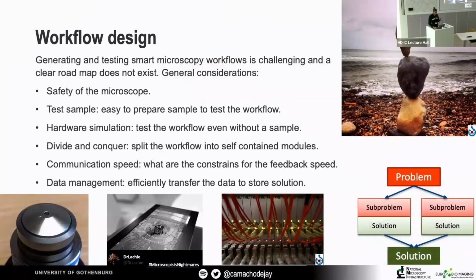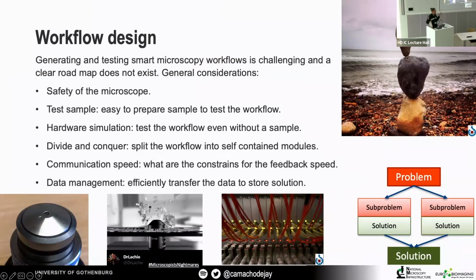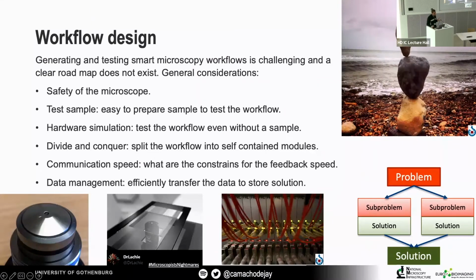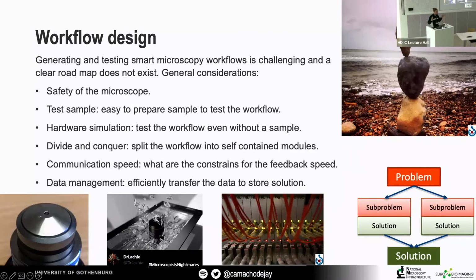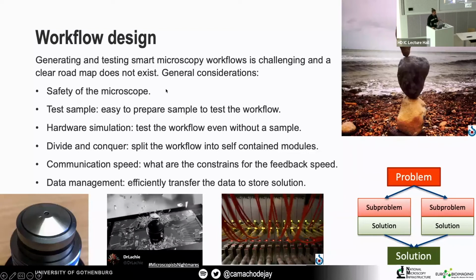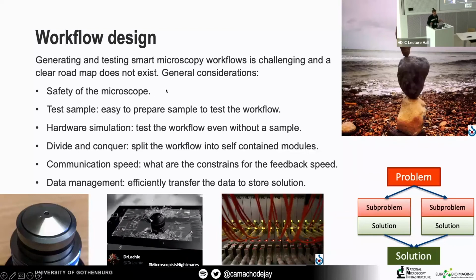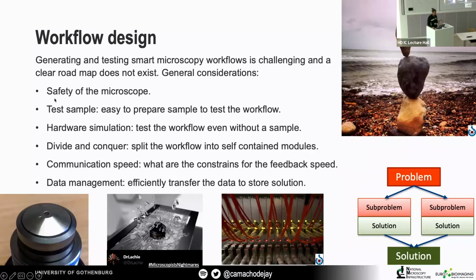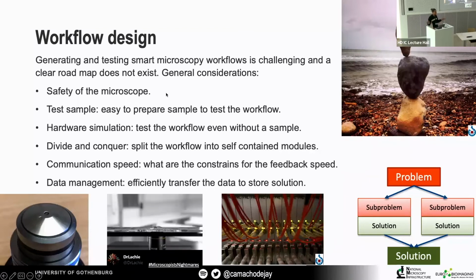And the reality is that, at least in my experience, this is an extreme balancing act, right? So you really have to see how you manage to make such a pipeline available. And there is no clear roadmap that I can come and tell you, if you follow steps A to B, you will be successful, right? So I think there are some general considerations that I hope we can all agree on. And the first of all, in my mind, is of course the safety of the equipment, right?